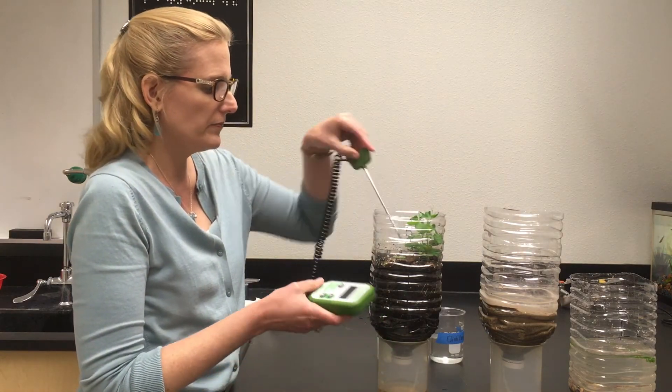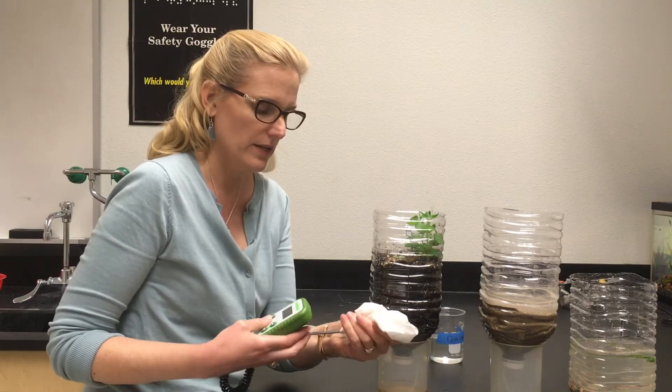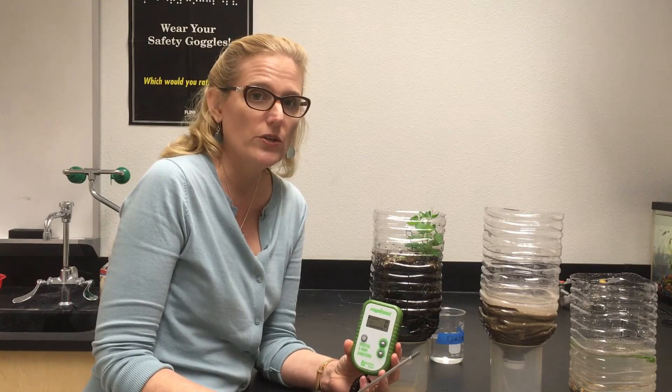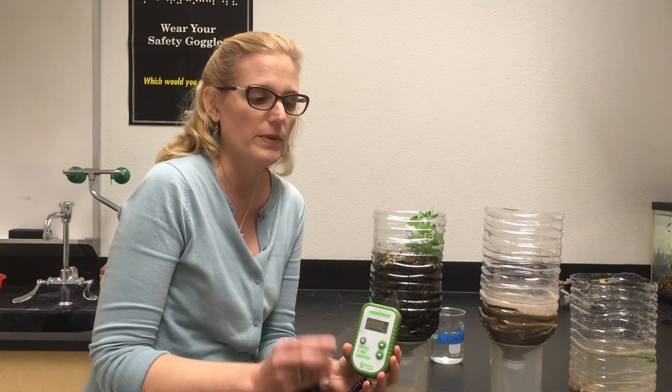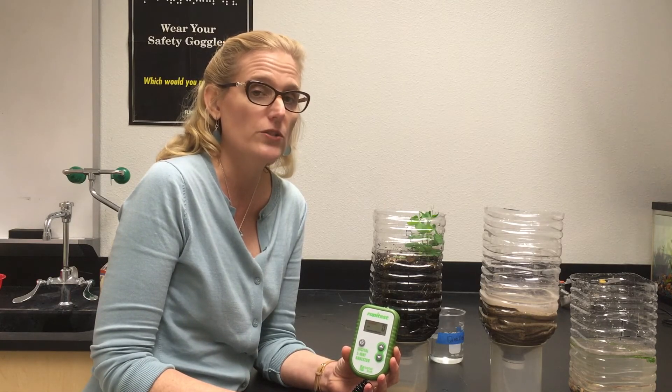When I am done, I want to go ahead and wipe it clean. You do not submerge this probe in water. Some of the other probes we use require rinsing in distilled water, but this soil probe does not get submerged in water — you just wipe it clean.